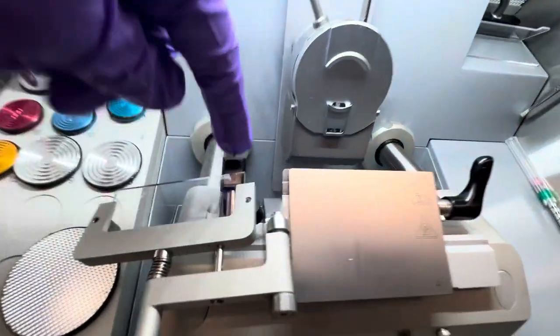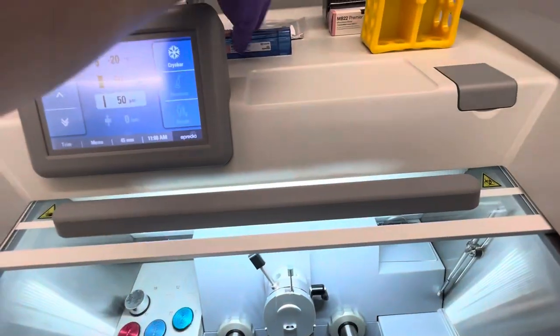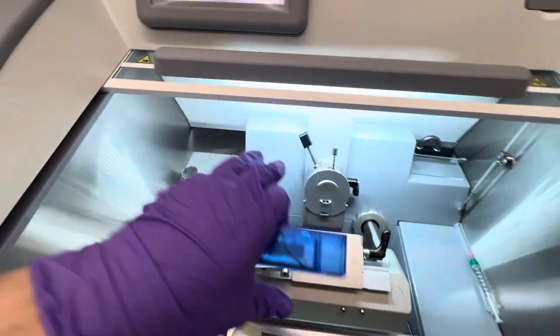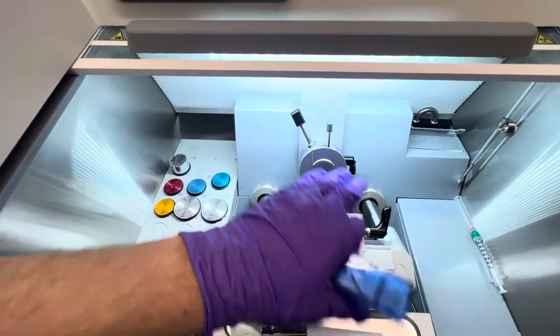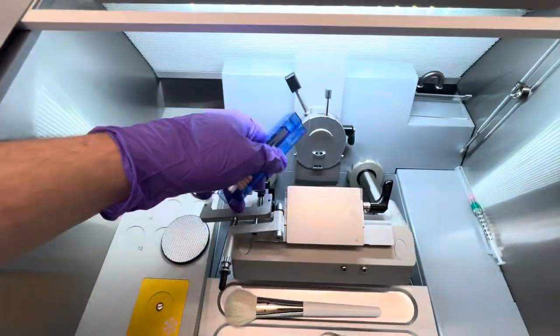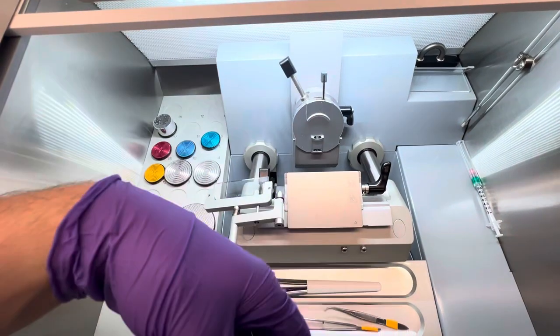So here, I describe it as this is where you slot your blade in, and I'll show you that. So here again, the microtome blades. So all this is the microtome setup. This is a microtome within a cryostat. The cryostat is essentially just a big freezer, and you shove a microtome in it, which is for sectioning pieces of tissue.